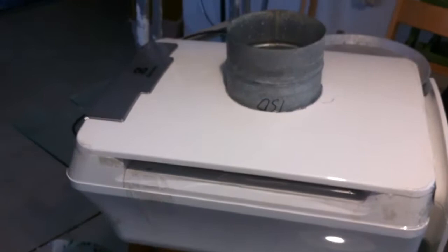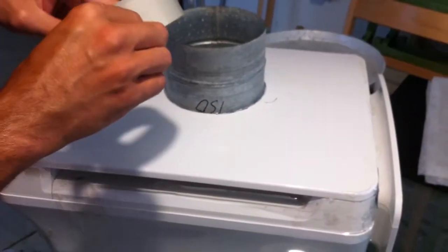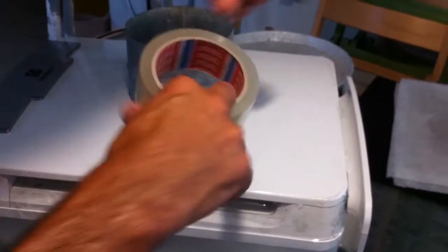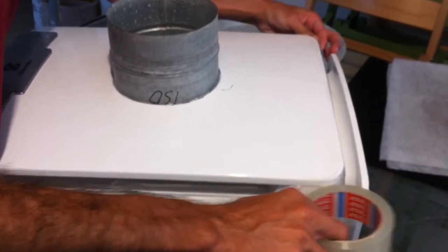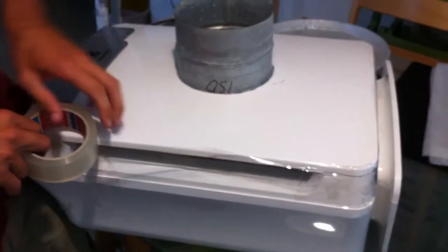Except for the screws, it took two minutes to change the filter. It's a very practical way to positive-pressurize your lab with a simple air cleaner.